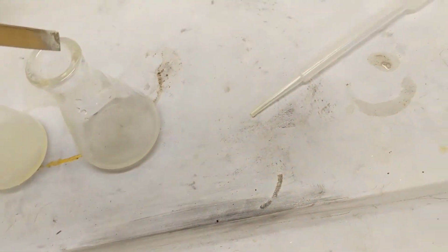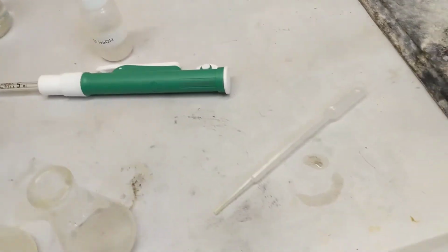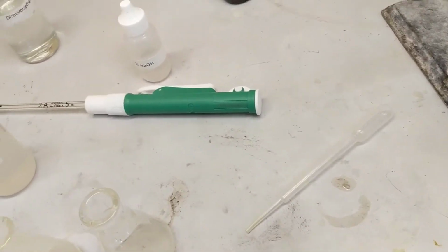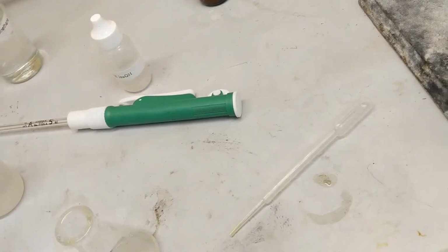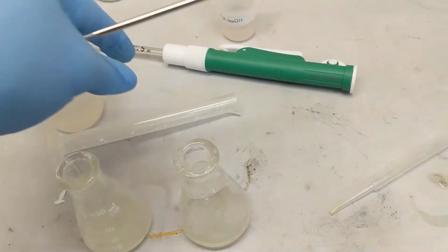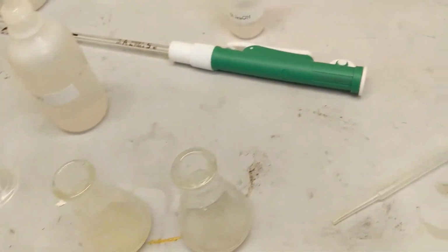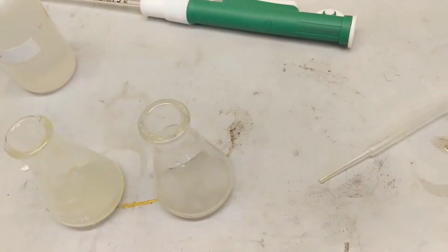I'll check the pH. Hold on, let me clean this off. There we go, nice and clean. Stir it up, check the pH.